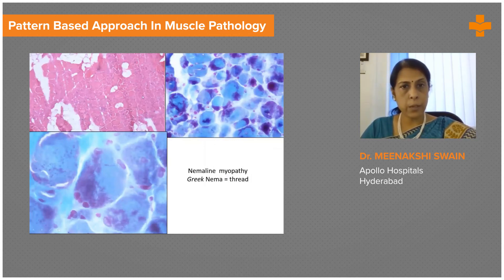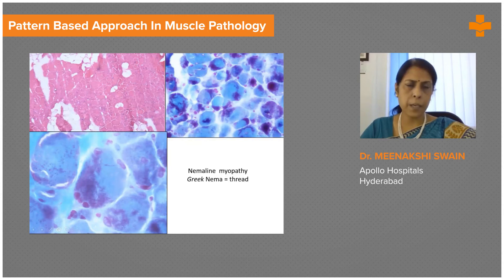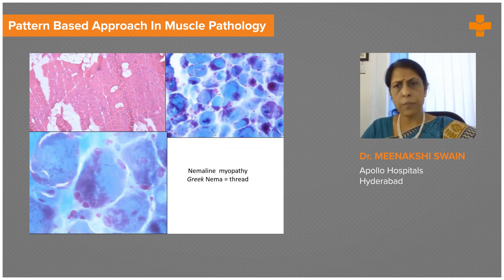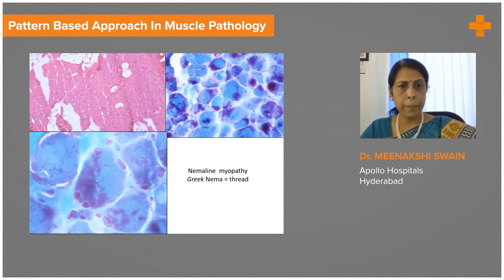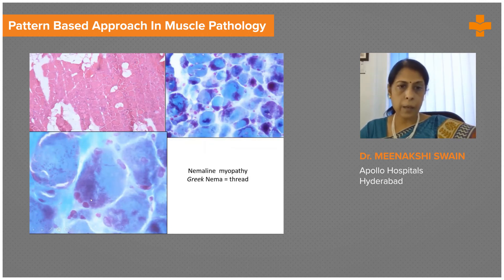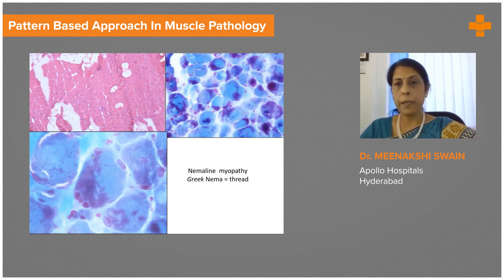This is a biopsy of a young child where the H&E, except for mild variation in fiber size and some adipose tissue infiltration, doesn't show too much. But there's a beautiful appearance of rods seen on the Gomori trichrome stain — these red, small rods and dot-like inclusions, shown here under oil immersion. This is a typical picture of nemaline myopathy.